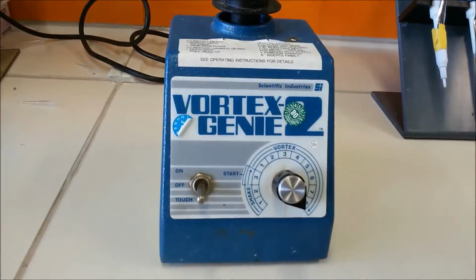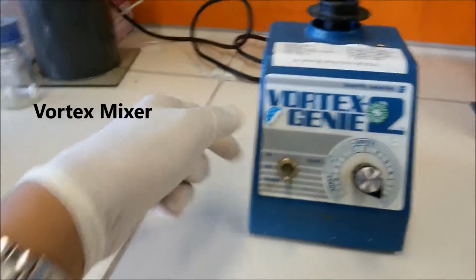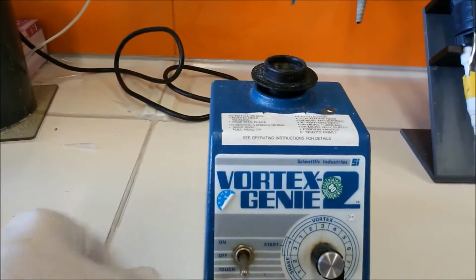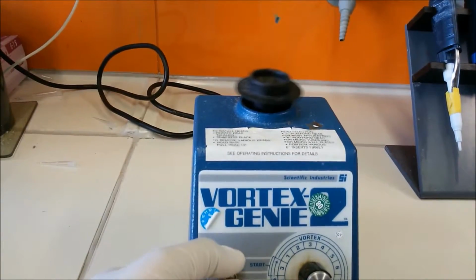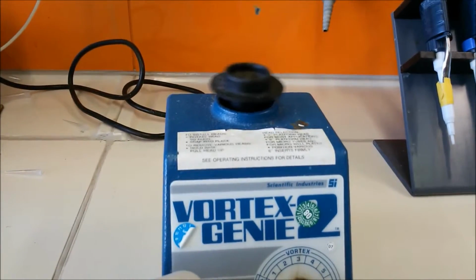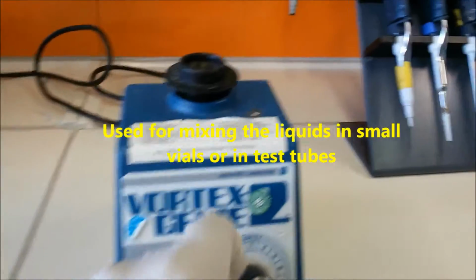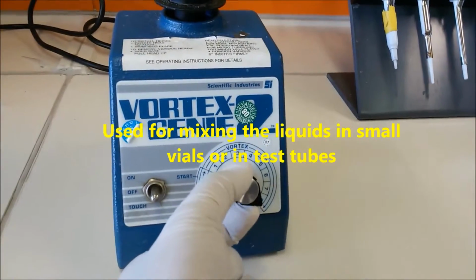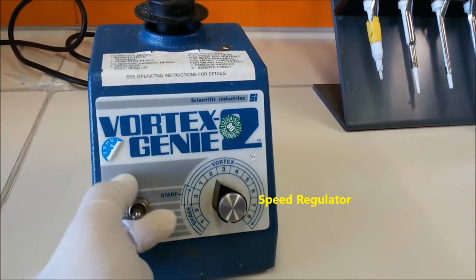Now you see in front of you a Vortex mixer. We call it Vortex because look at it. So now it's off, and now it's on. You can see it. Just like this. We use it to mix, and we can adjust the intensity here, how fast we want it to move.